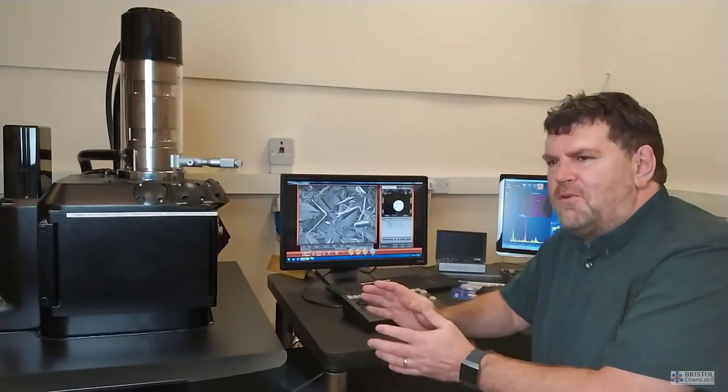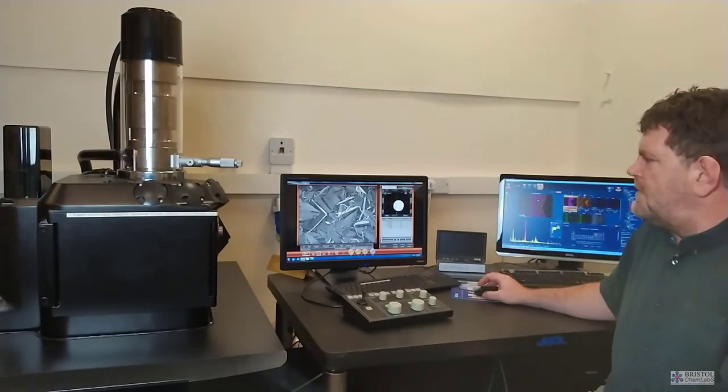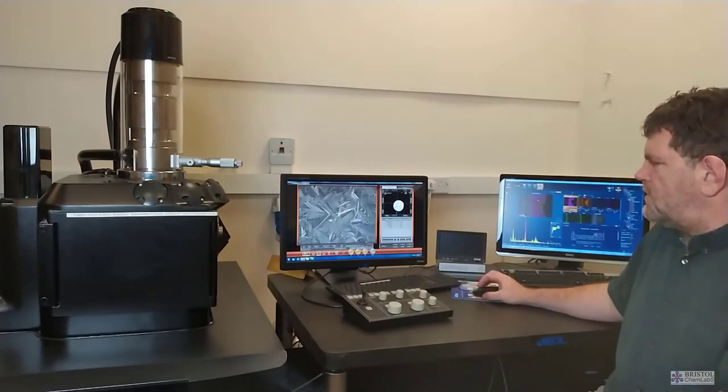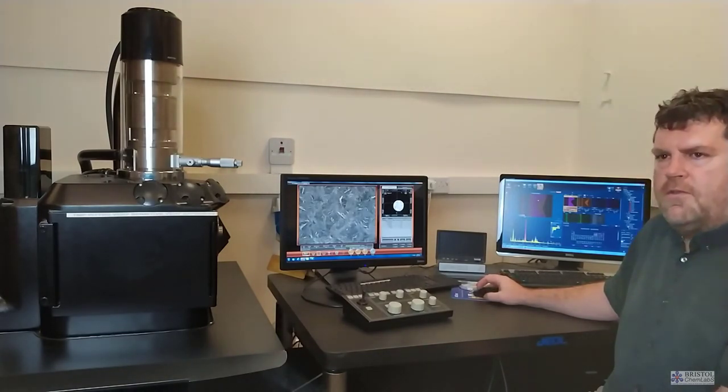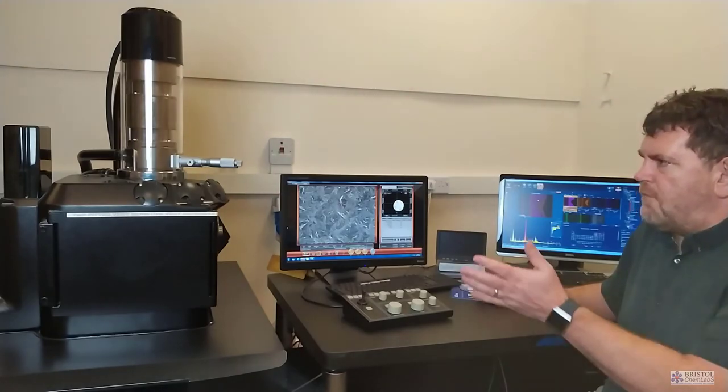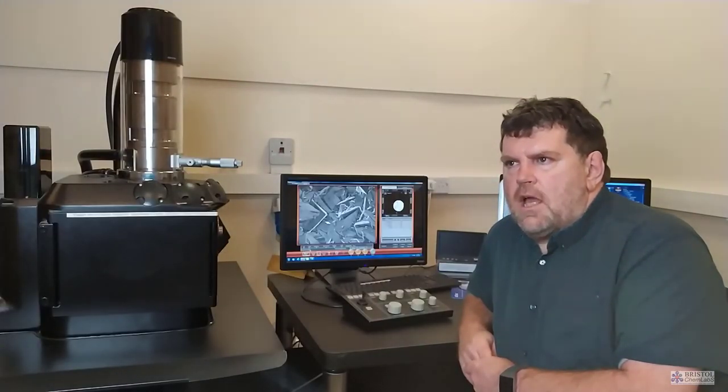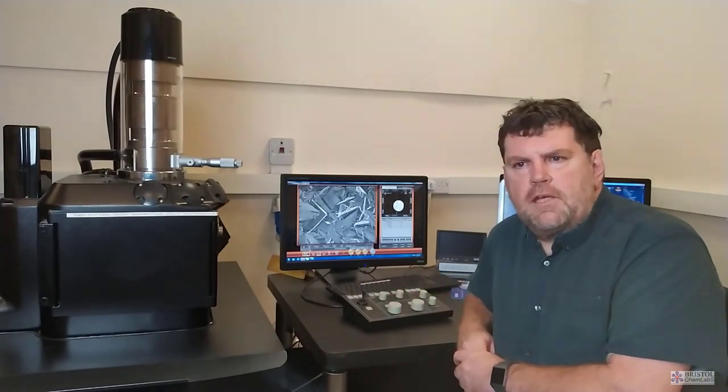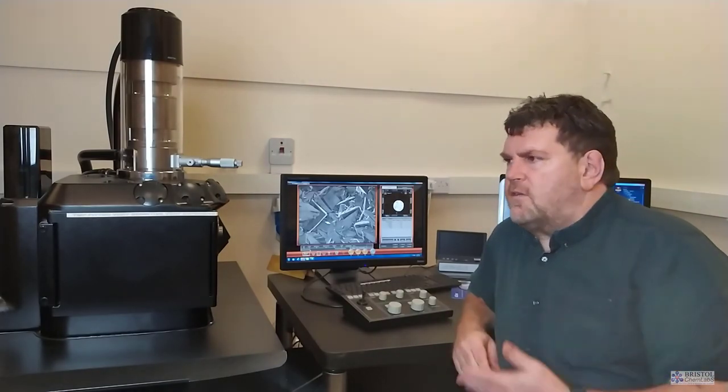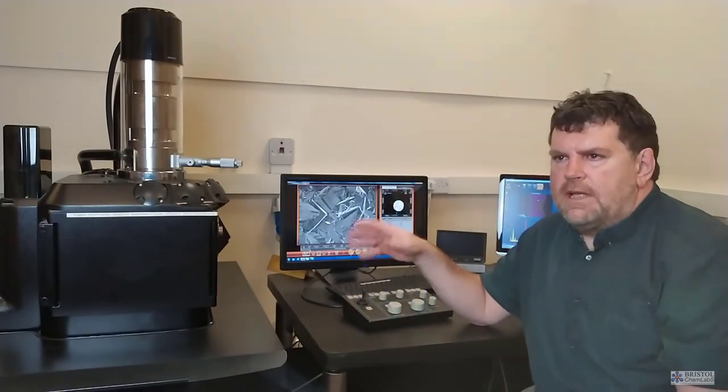Once the sample's safely in the column and evacuated, there's no damage you can do to the instrument. Everything else is really just an interface with a screen, and there are multiple ways of interacting. Using a mouse, you can zoom in, zoom out, drag and move the sample around. There really is very little training needed apart from being able to safely load and unload samples. For the scanning electron microscope, it's literally a couple of hours to get the first introduction. The only damage that can be done to the electron microscope is in loading and unloading. That's where there can be mechanical damage to the electron microscope, to the lenses, to the apertures.